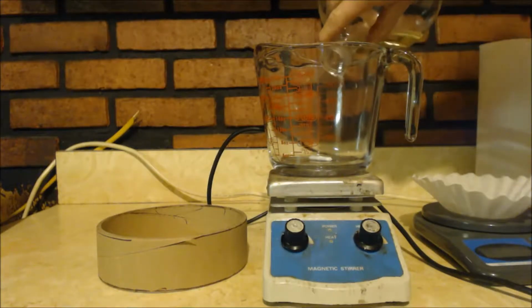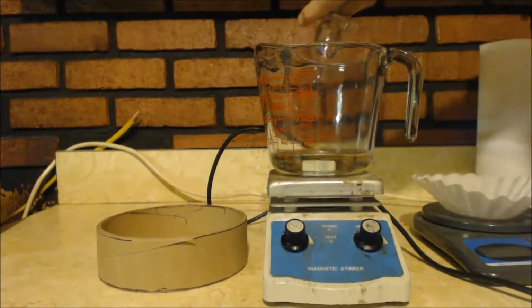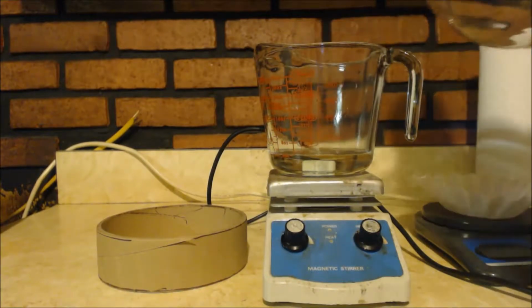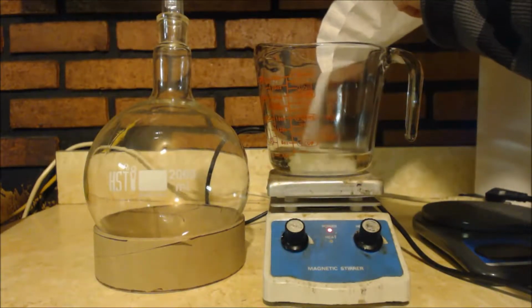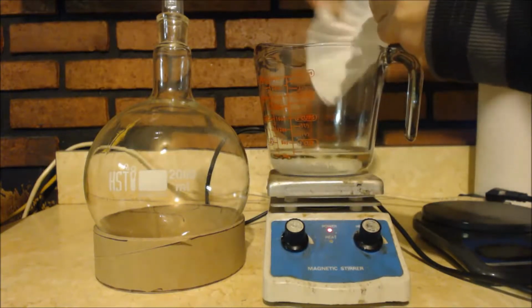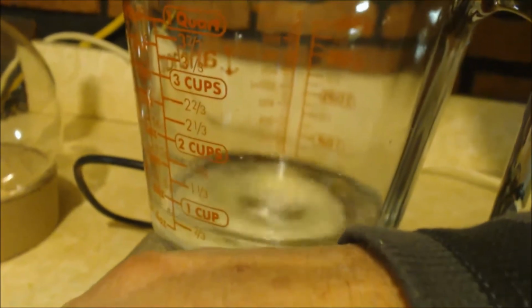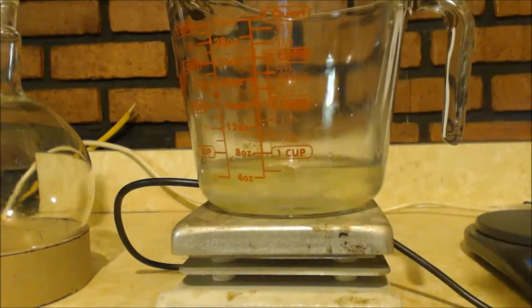And I'm going to stir it, hopefully get rid of the rest of the impurities. Hopefully it'll split up into two phases and I can put it in a sep funnel. But I doubt it. But I got a plan for that. I don't really see anything happening. I was hoping some red stuff would come out like it did when we used the acid. Well, we'll let it stir up. Put some cellophane over top.